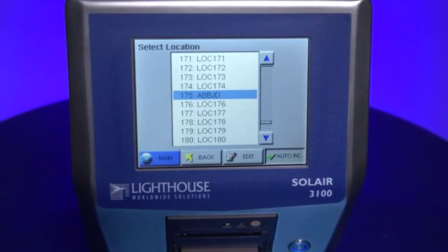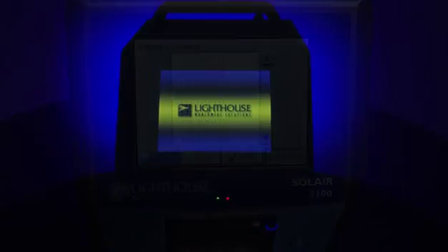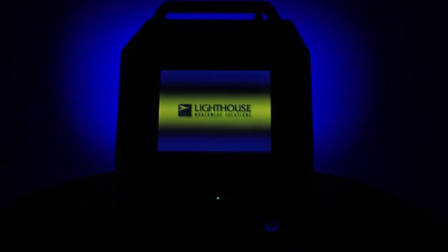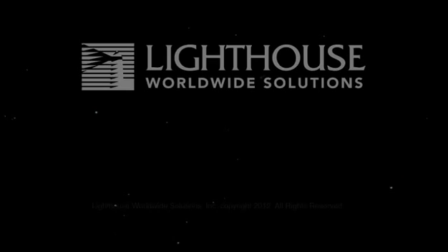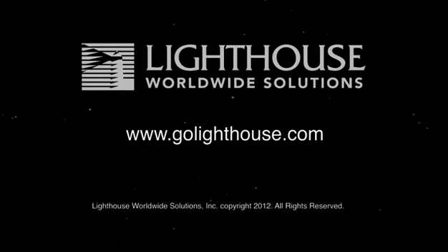Locations are a powerful tool that can be used to track data by a specific location, by room, and much more. This concludes the training on selecting and editing location labels. For more information on Lighthouse products, please go to www.golighthouse.com.